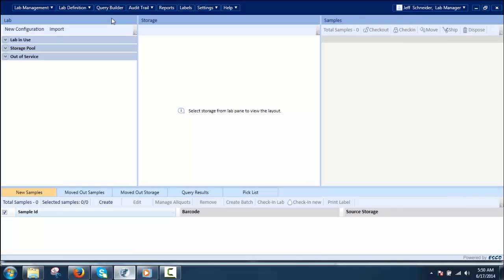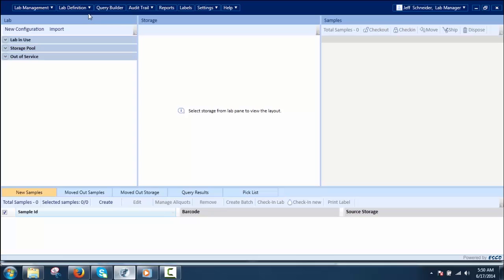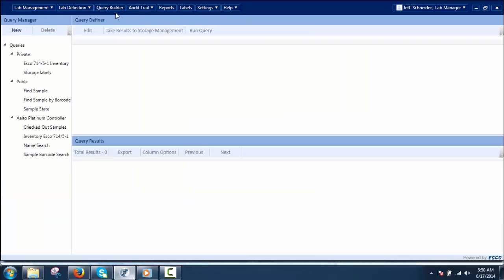The Sample Tracker also has a powerful search engine that allows for customized queries. Query Builder is a tool where samples and storages of interest can be searched from the database. The user can build a query based on sample focus or storage focus, and according to the focus of the query, the relevant fields will be available to the user.